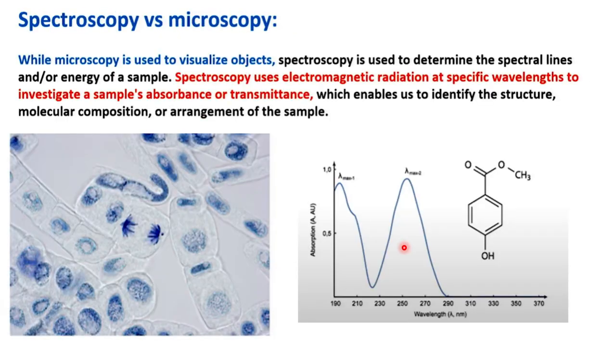Now what is the difference between spectroscopy and microscopy? This is the image of a particle, and obviously here the scale should be mentioned. Until and unless there is a scale, the data is not accurately represented. For example, if it is 10 millimeters, we can say what the dimension of this particle is. Without a scale, I cannot say what the dimension is.